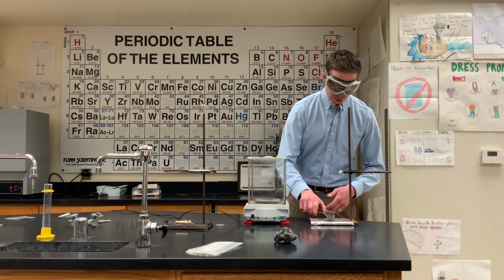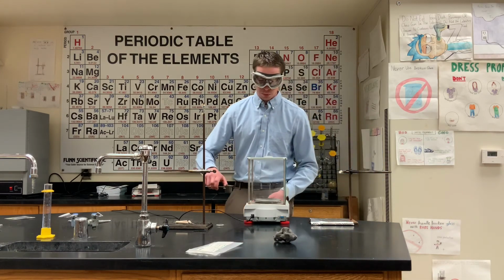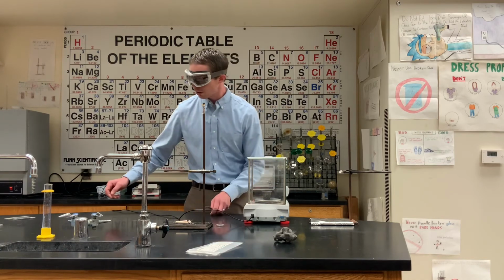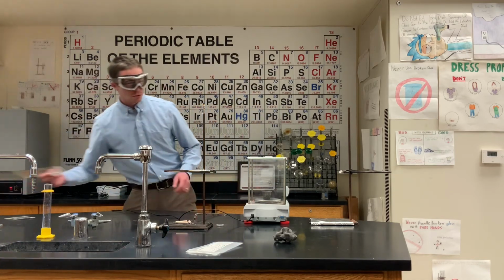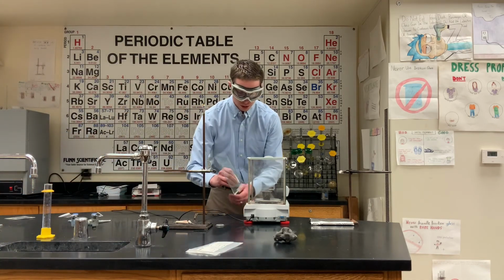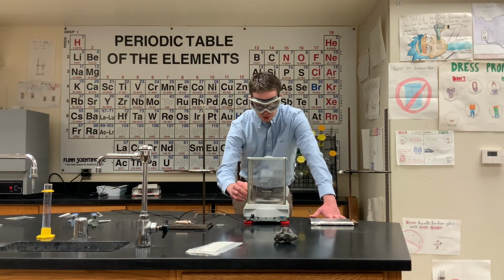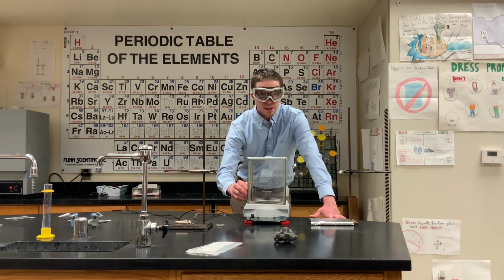All right, and drum roll, we are going to put the crucible with the lid and the magnesium oxide back into the analytical balance. We are going to get our draft guard up here, and lo and behold, the two masses agree. We have a final mass of 28.329 grams.